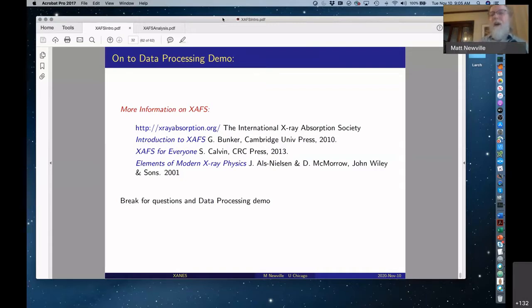For people who come to my beamline, my standard boilerplate is that 10 ppm we can do, XANES for sure. We're trying to do HERFD at 10 ppm, and at 100 ppm we can definitely do some, maybe first-shell extended XAFS. To do better than first-shell extended XAFS, it's more about the sample, the beamline, the energy ranges, and so on. So at 100 ppm, there's hope. It's doable. 50 ppm, it's not out of the question.